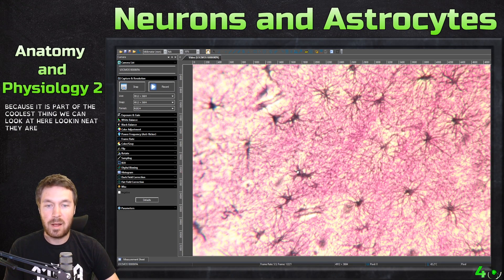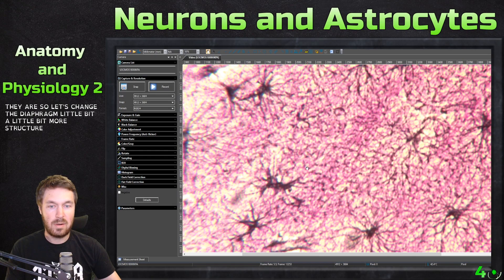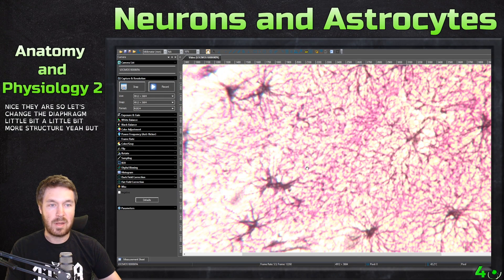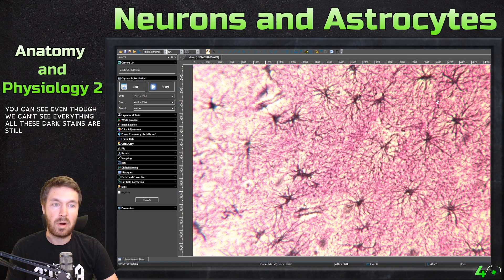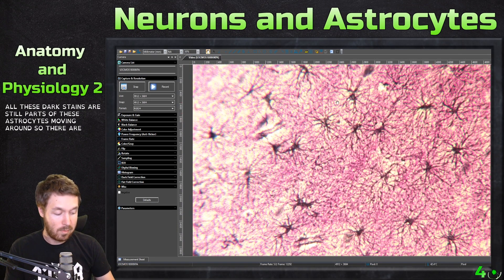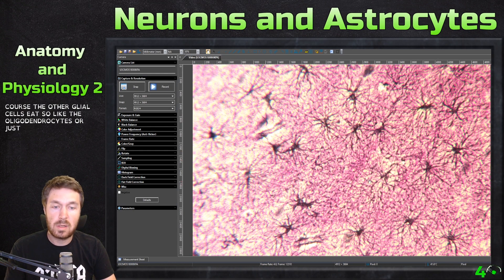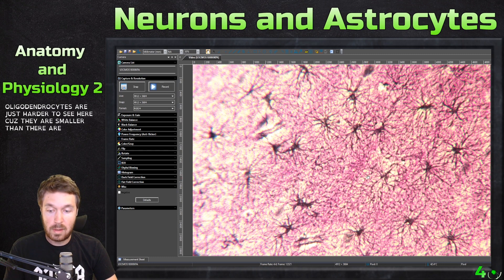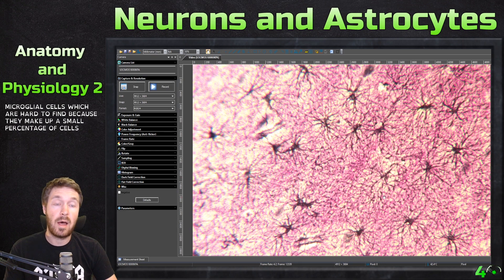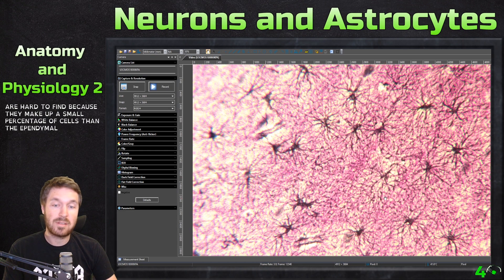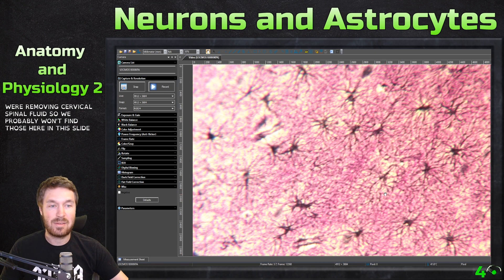Look how neat they are. Let's change the diaphragm a little bit and see if we can make a little bit more structure. Here you can see — even though we can't see everything — all these dark stains are still parts of these astrocytes. Of course there are the other glial cells, like the oligodendrocytes, but they're just harder to see here because they are smaller. Then there are the microglial cells, which are hard to find because they make up a small percent of the cells. The ependymal cells are found in select areas where we're moving cerebral spinal fluid, so we probably won't find those here on this slide.